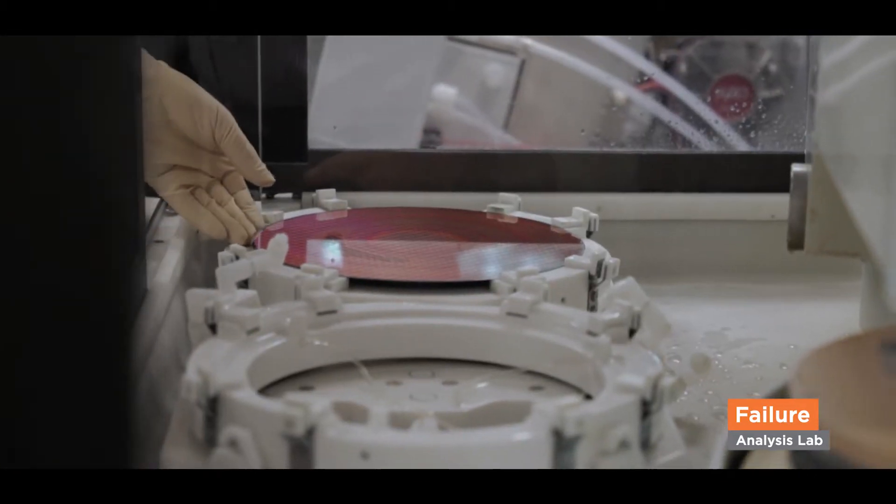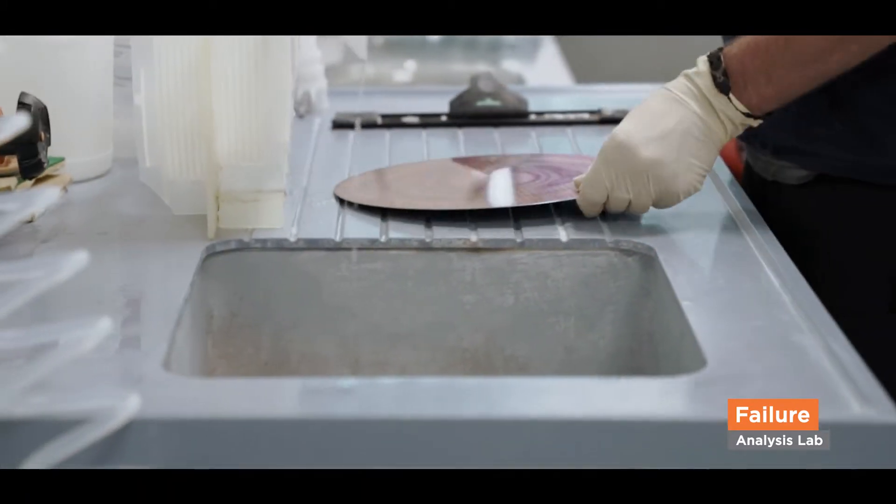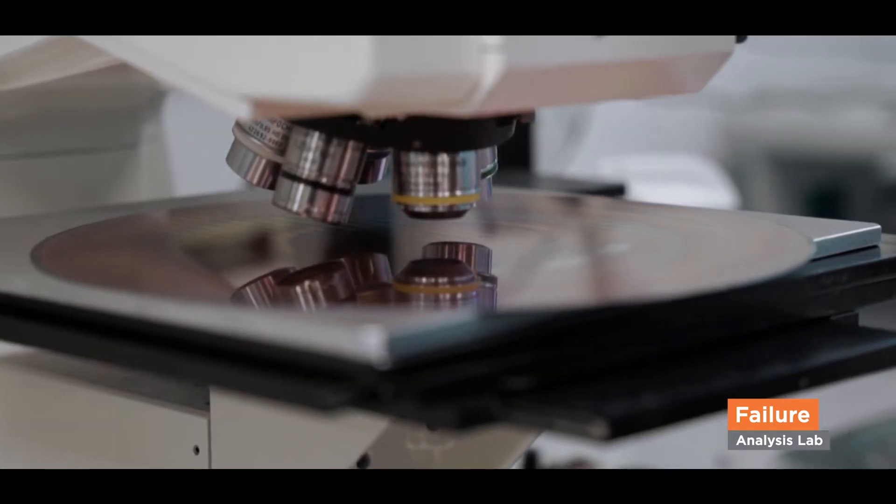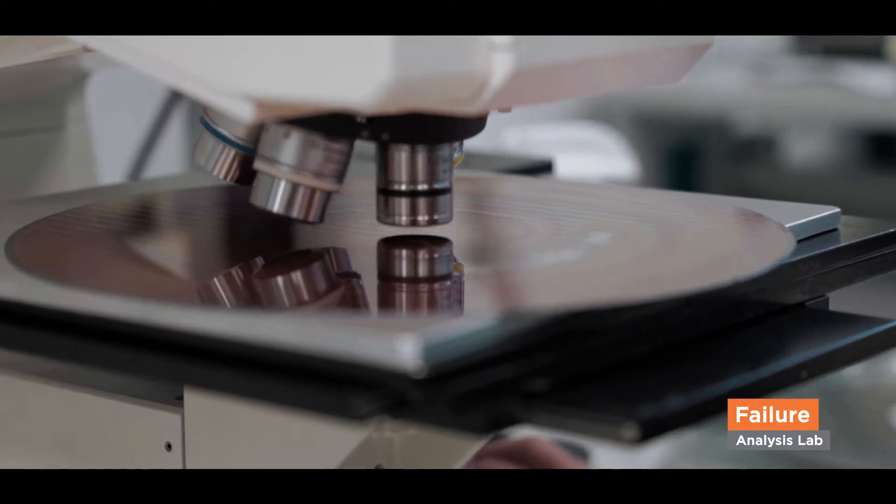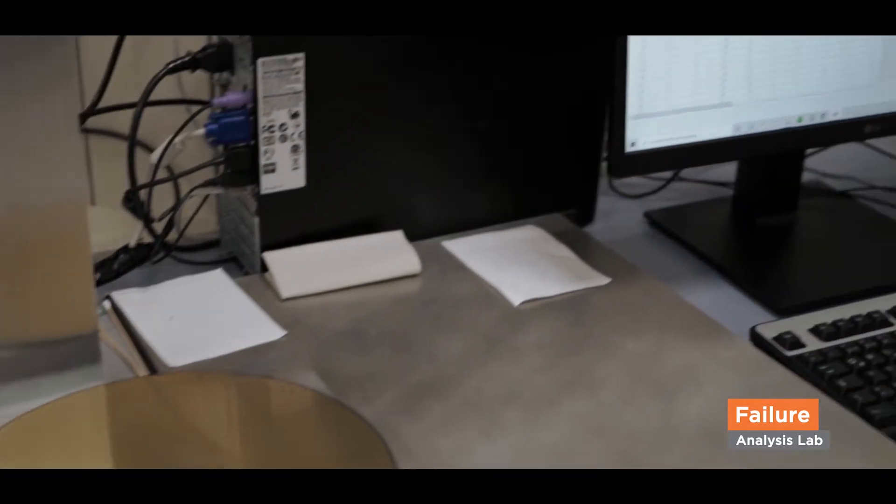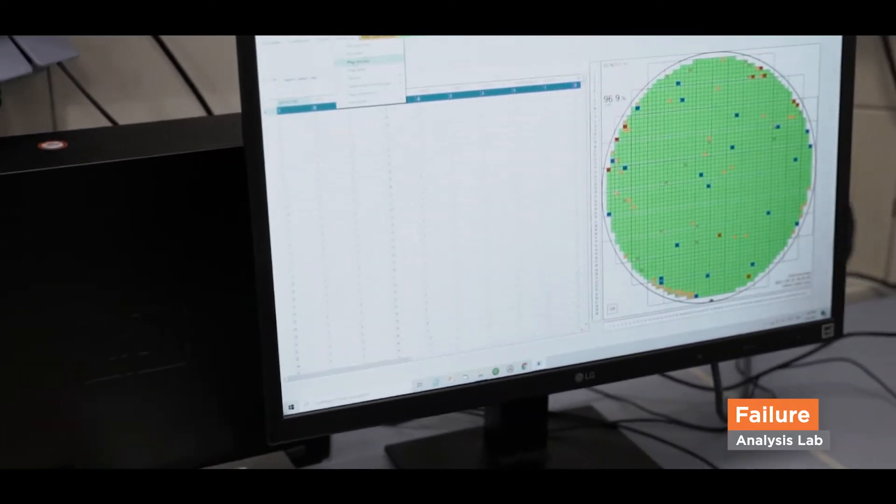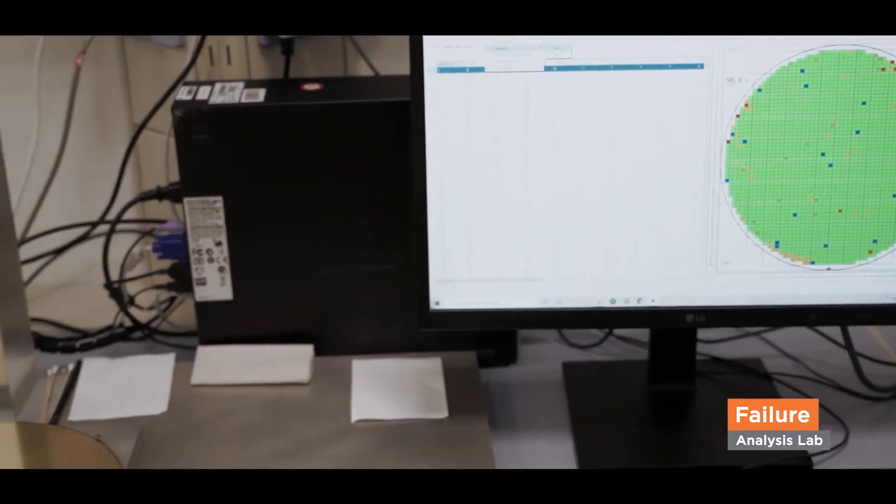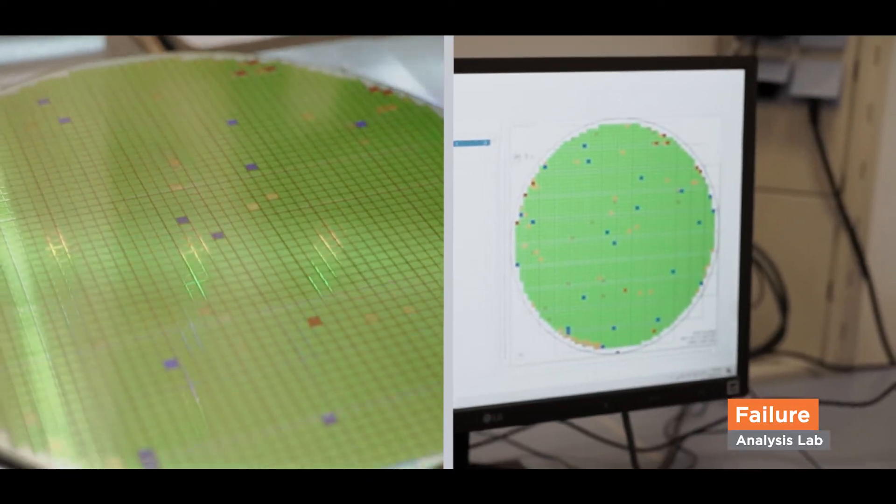We use wet and plasma chemical processes to remove layers, but also a full wafer polisher for controlled thinning of the wafer. Another self-invented and useful tool is the wafer beamer. It is used to project defect or yield wafer maps directly onto the wafer to mark dies or areas more easily.